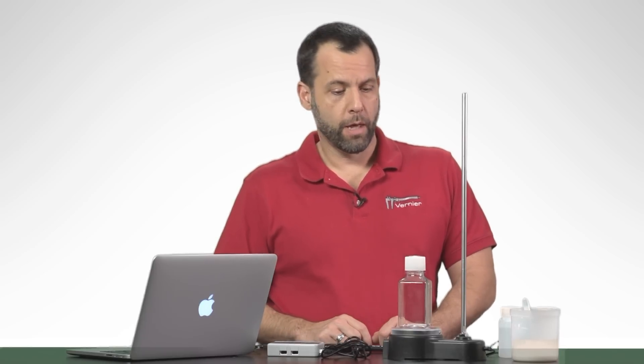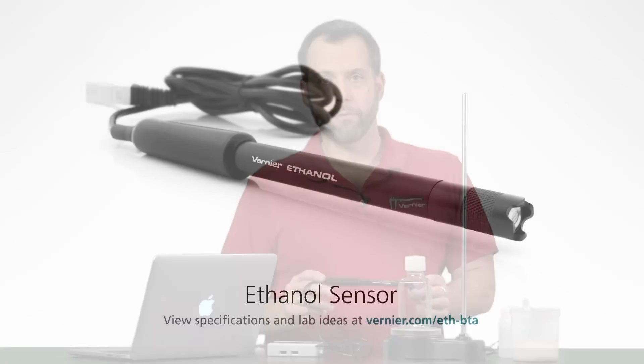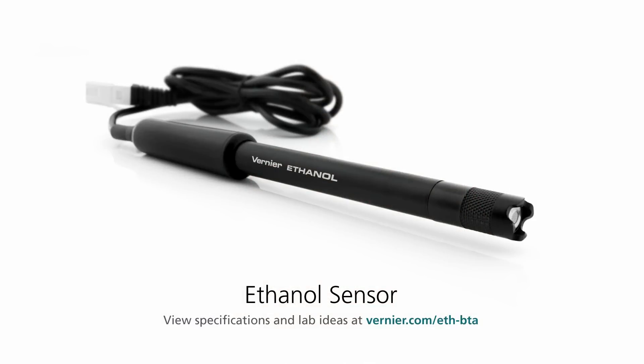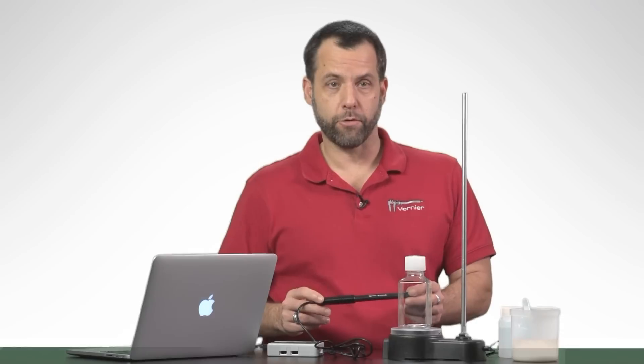Specifically, you can investigate the metabolism of monosaccharides or disaccharides or lots of different sugars, or what we call carbohydrates. This experiment utilizes yeast and is derived from an experiment in our Investigating Biology Through Inquiry Book. You can do it using a CO2 gas sensor, but in this case I'm going to be using a Vernier ethanol gas sensor. This is a much more affordable way to actually do this investigation.